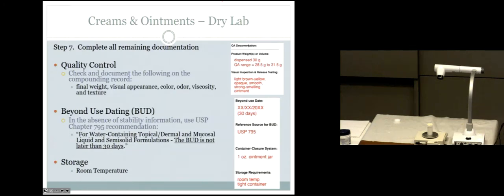Okay. 2 things we want for the storage conditions: room temperature. So you'll just keep them at room temperature, and we do want an airtight container because you can lose humidity or absorb humidity depending on the base. So keep them in a tight container at room temperature.